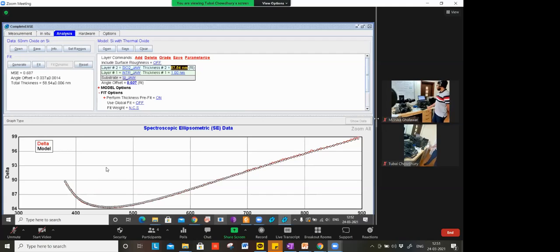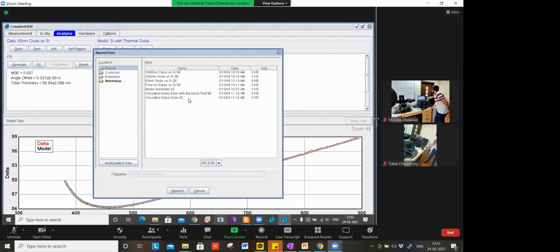There are some limited options in this version. In the updated version, there are more options; we can change the graph color. We can check some other data also, another one.